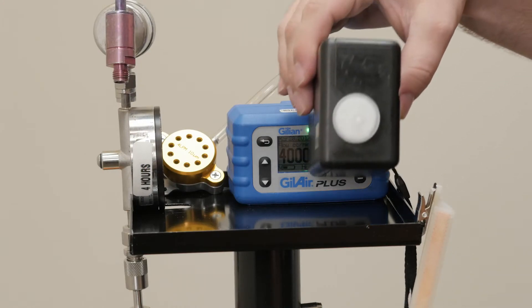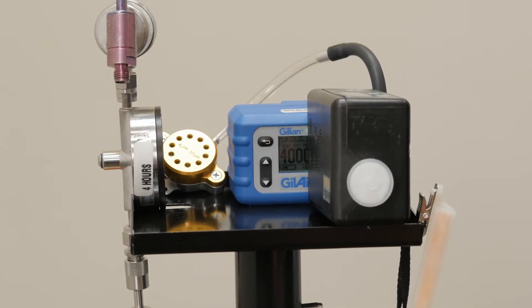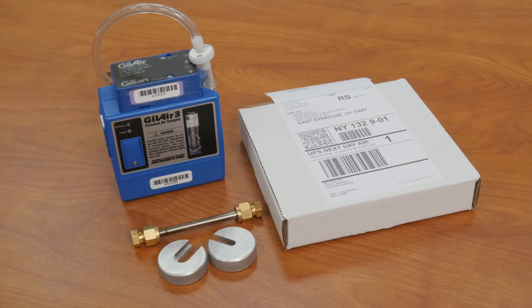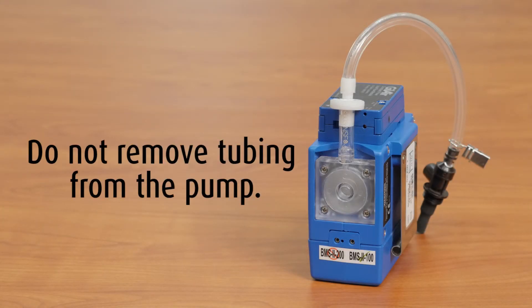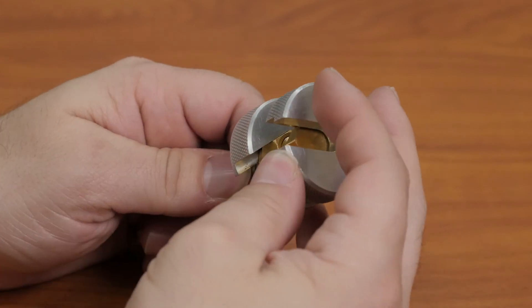Place the unit on the sampling tray and indicate the start time on the chain of custody. Lastly, set up the sampling pump and thermal desorption tubes. First, remove the pump from the case. Do not remove the tubing from the pump, as this is where the calibration is stored. Using the provided wrench set, remove the caps from the end of the media tubes.